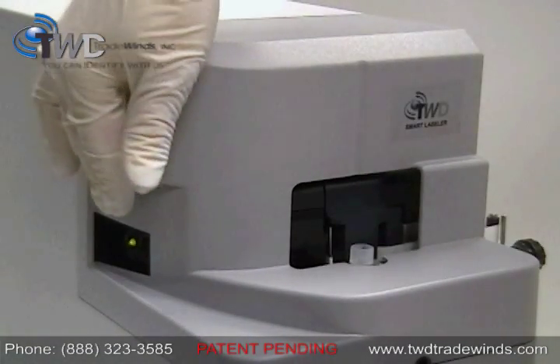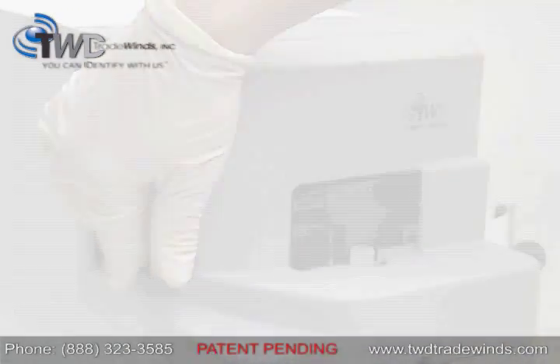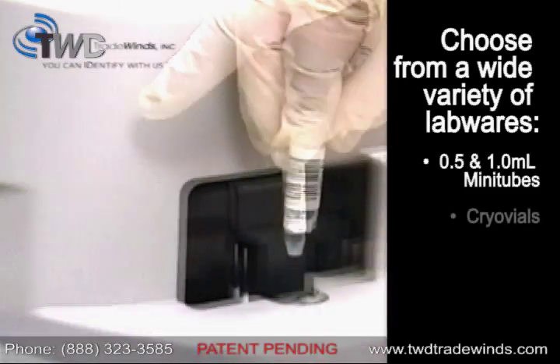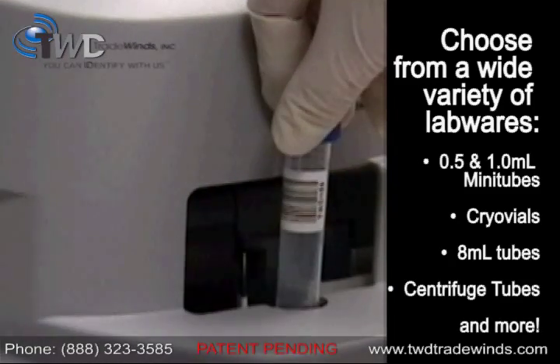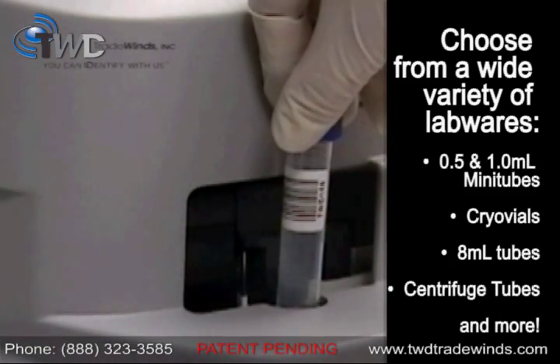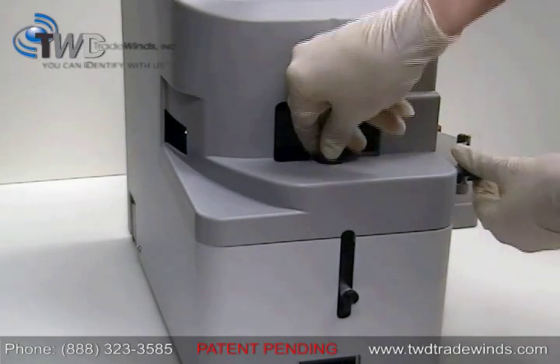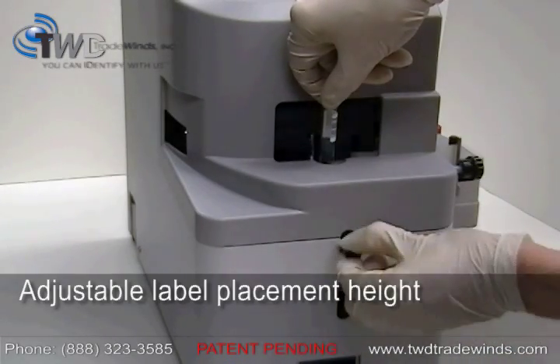The Smart Labeler can auto-adjust to different tube diameters, giving you a wide range of compatible labware choices, such as plastic mini tubes, cryovials, 8 milliliter tubes, 15 milliliter centrifuge tubes, and more. Label placement height can also be adjusted, allowing you custom control to match your application's needs.